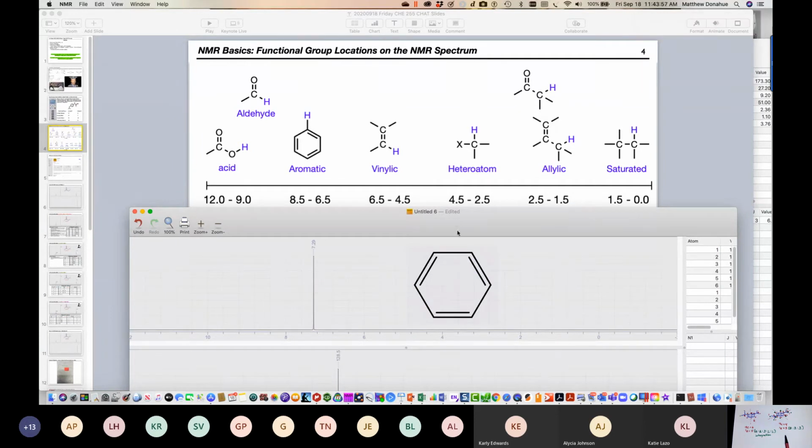So what you should take away from this demonstration is that you're considering the bonding environment of how things shift away from 0 increasingly towards 10. And so that tells you, it's an indication of where these hydrogens are, what functional group they're participating in.